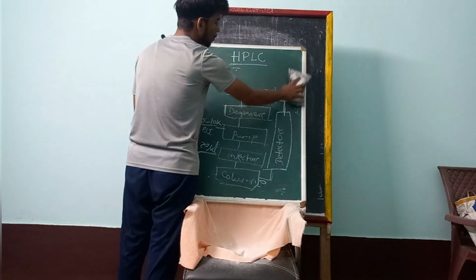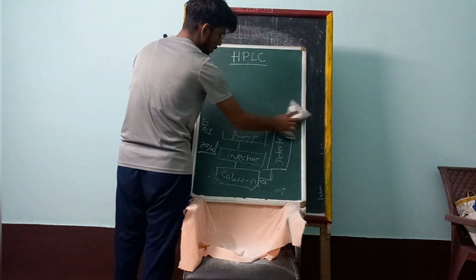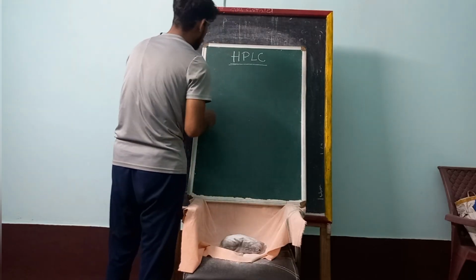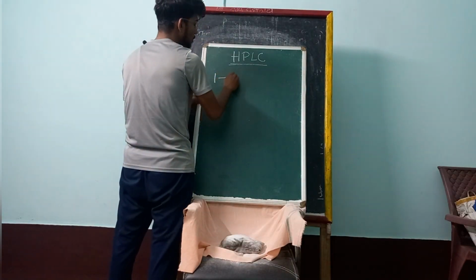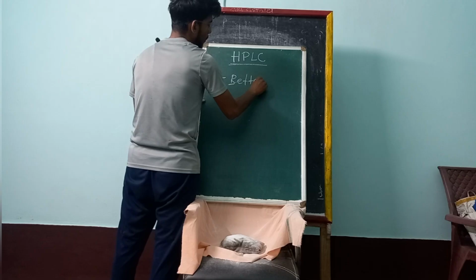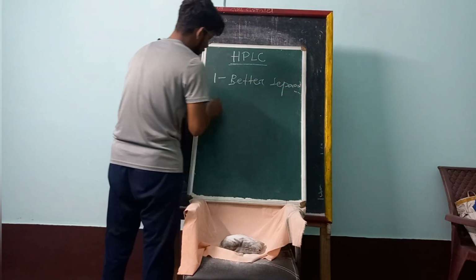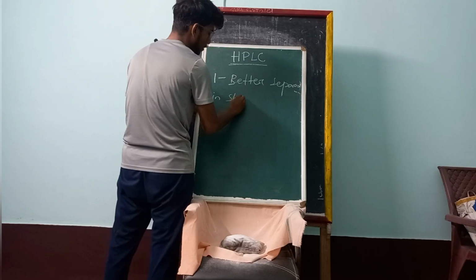Now we are going to the advantages of HPLC. The first advantage is better separation in a shorter time.